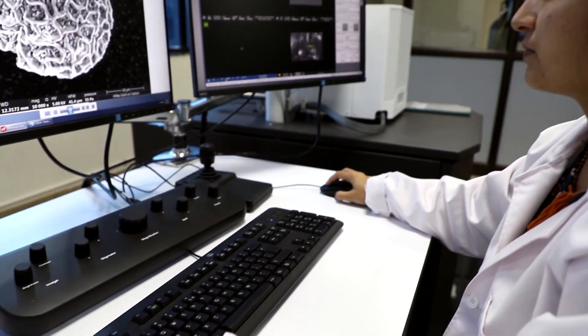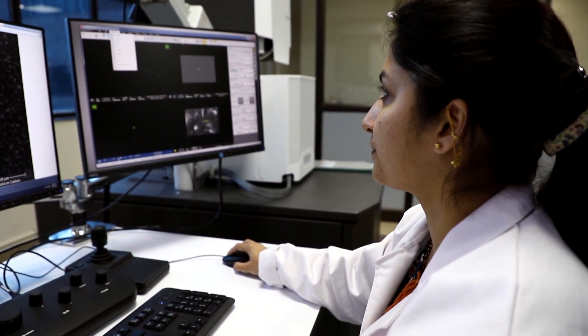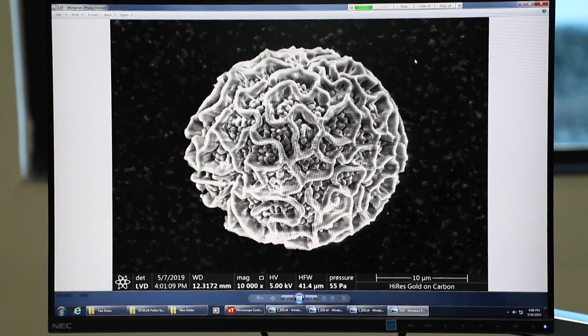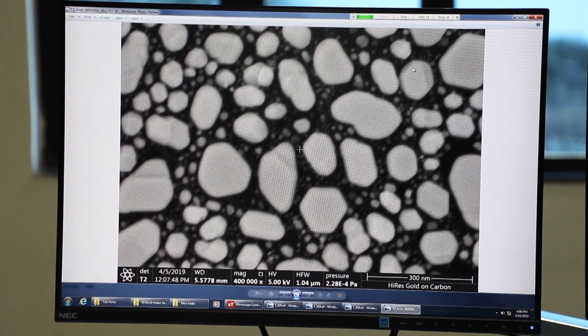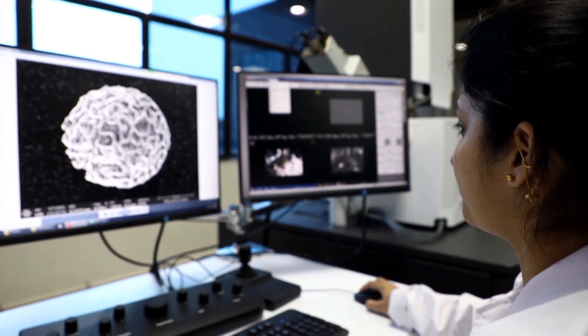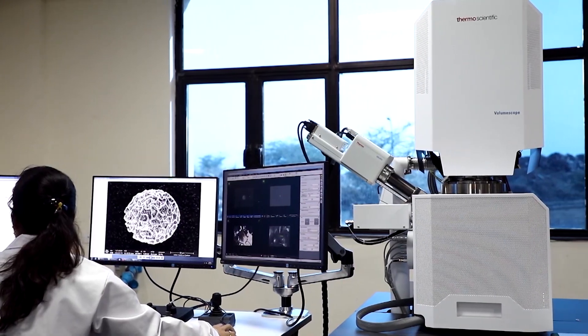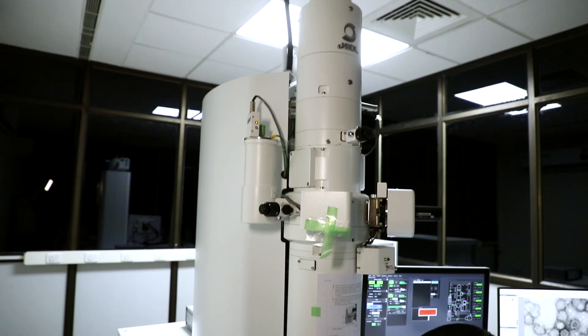This facility is useful in visualizing cellular and subcellular structures, proteins, stained and unstained samples, 3D architectures of cells and tissues. All this is done with the help of Volume Scope Scanning Electron Microscope and Transmission Electron Microscope.